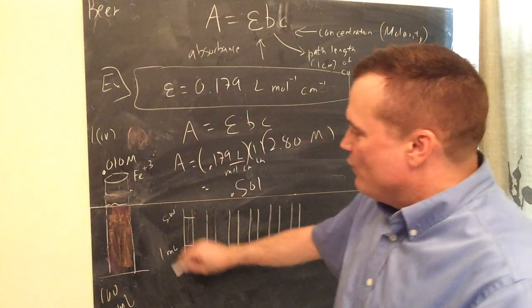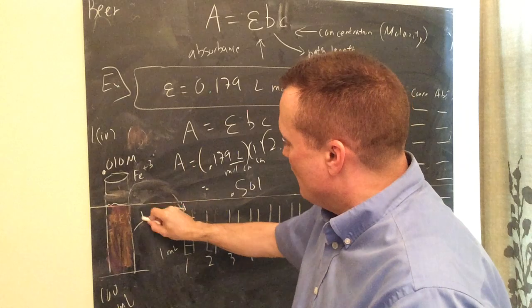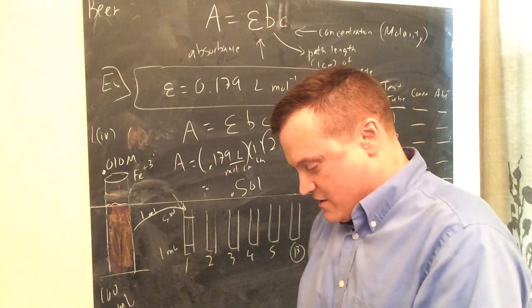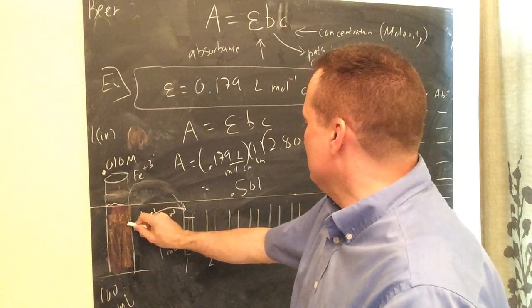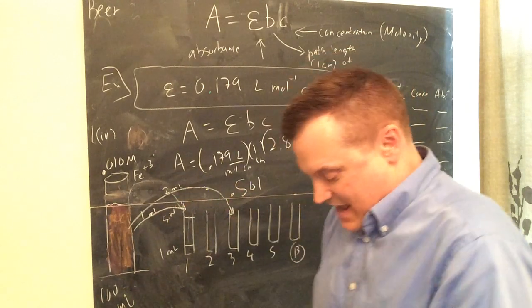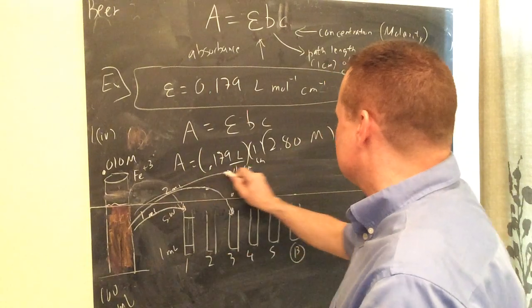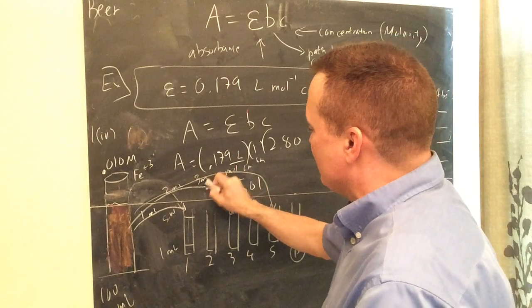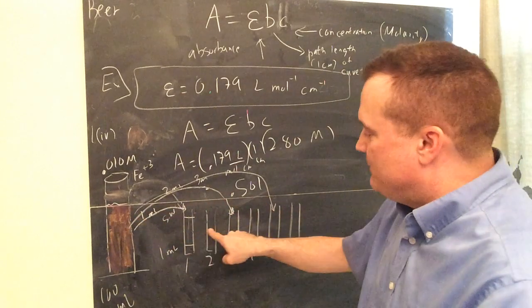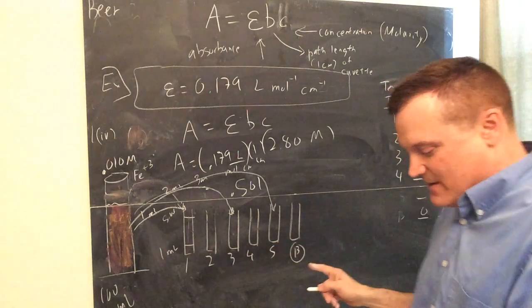Okay. So I put 1 milliliter into number 1. Oh, let me do it this way. From here to there, 1. Then for the next one, it says step 3, transfer 2 into test tube number, we'll go to 3. 2 of them will go into 3. We skip 2 for a minute. 2 milliliters. And then 3 milliliters will go into number 5. So we're skipping around a little bit. 3 milliliters go into there. So 1 milliliter of this into here. 2 milliliters of this into there. 3 milliliters into there. And then you put what? 1.5, 2.5, and 1.5 in the others. It tells you step 2, 3, 4, 5, up to 6.